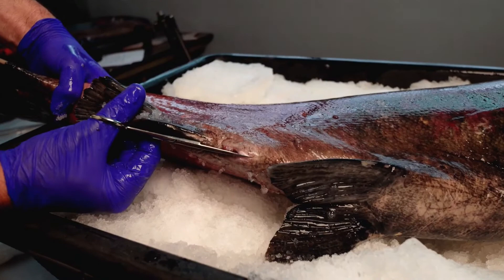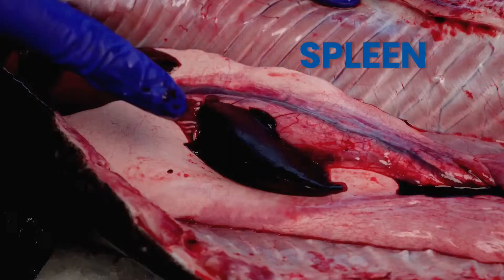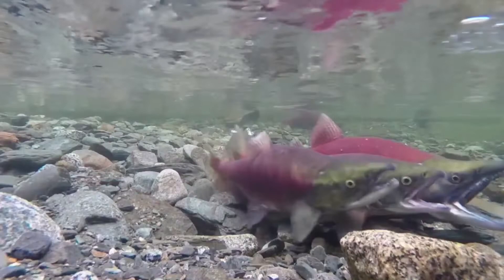Let's have a look at that internal anatomy. The first thing that really stands out to me are these paired large white testes. In the wild, the male salmon will swim alongside the female salmon and deposit sperm over the eggs. Here you can see the cloud of white sperm in the water.